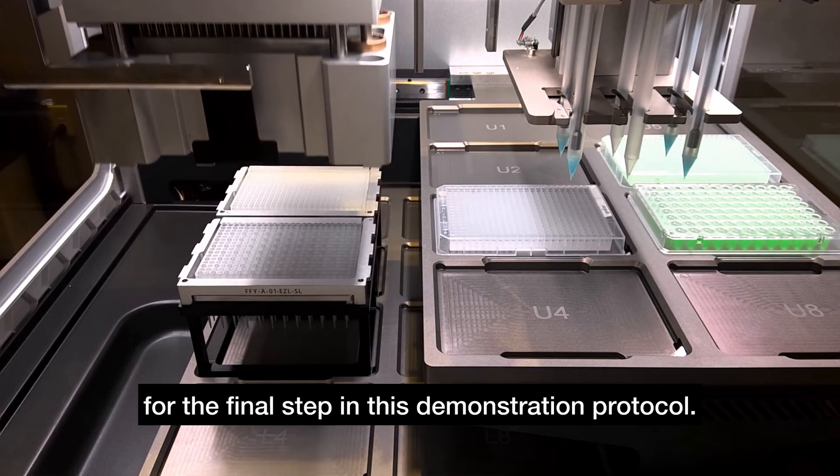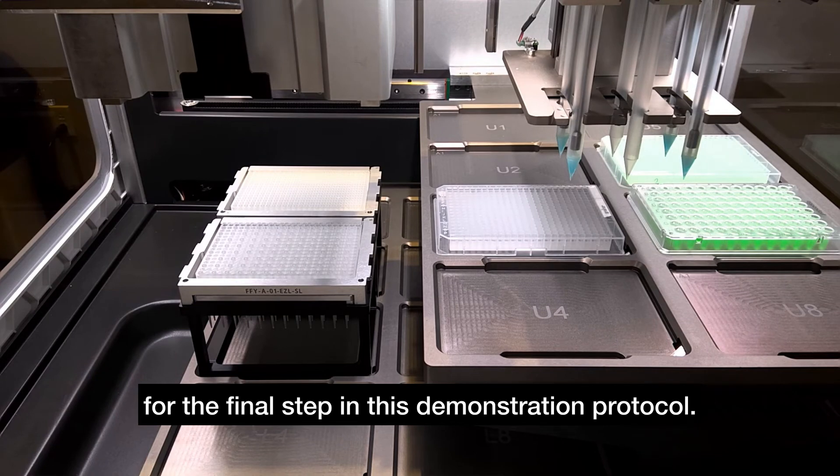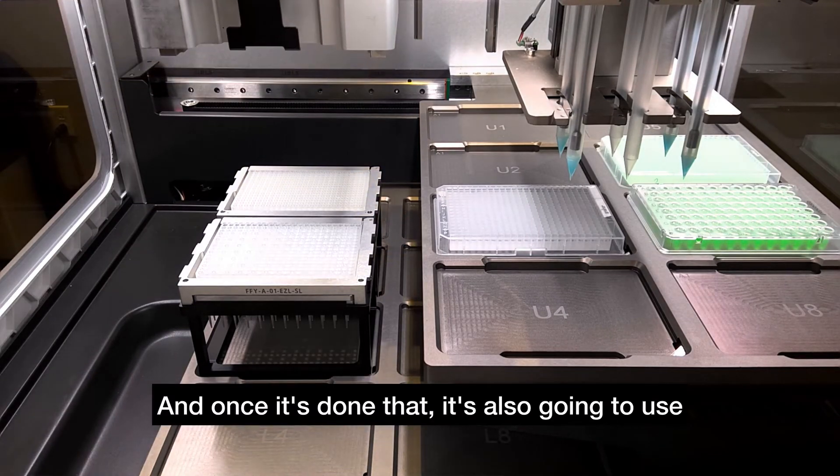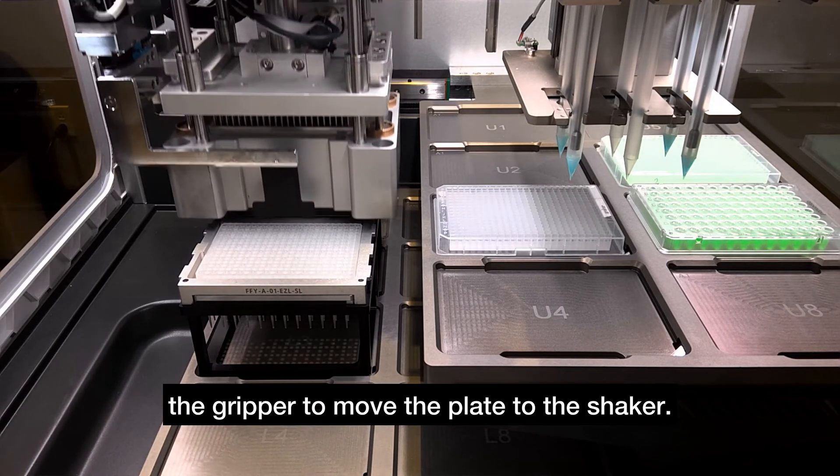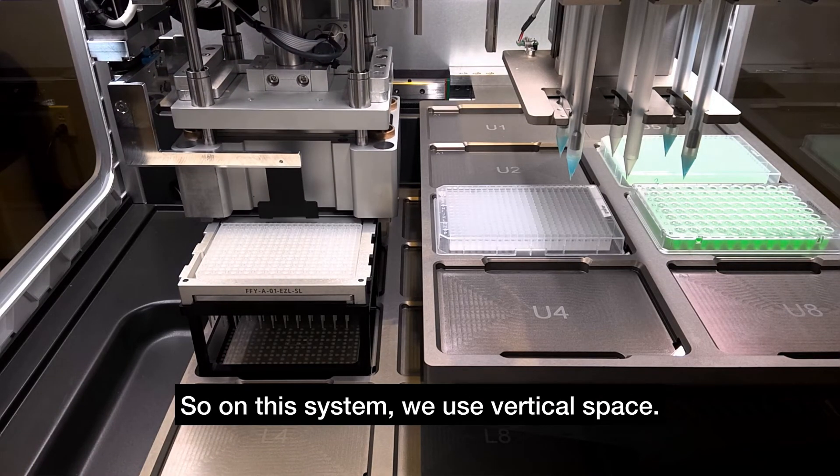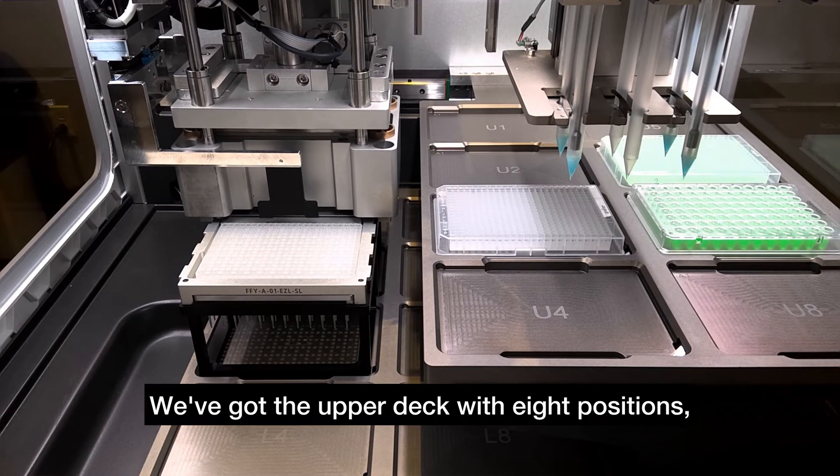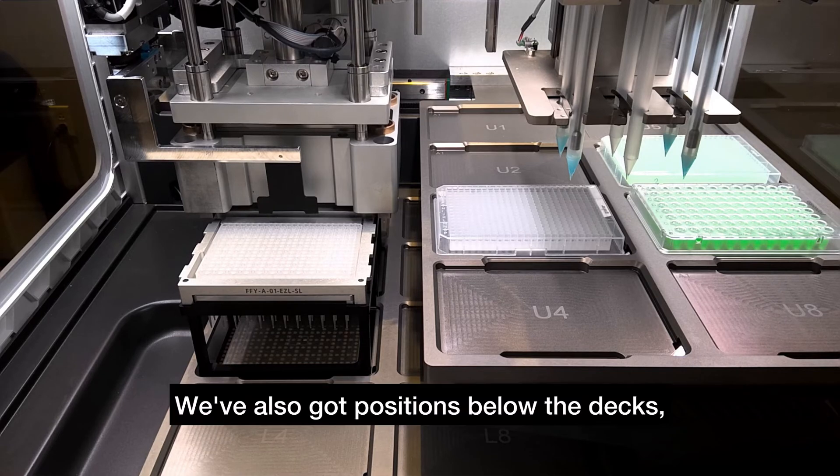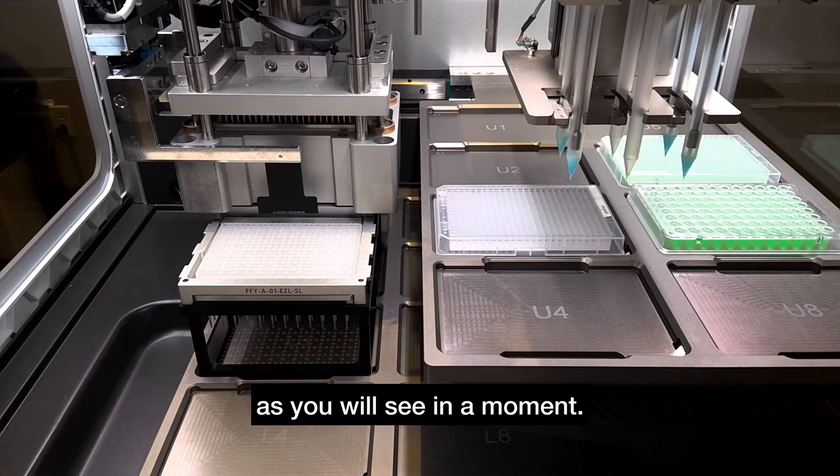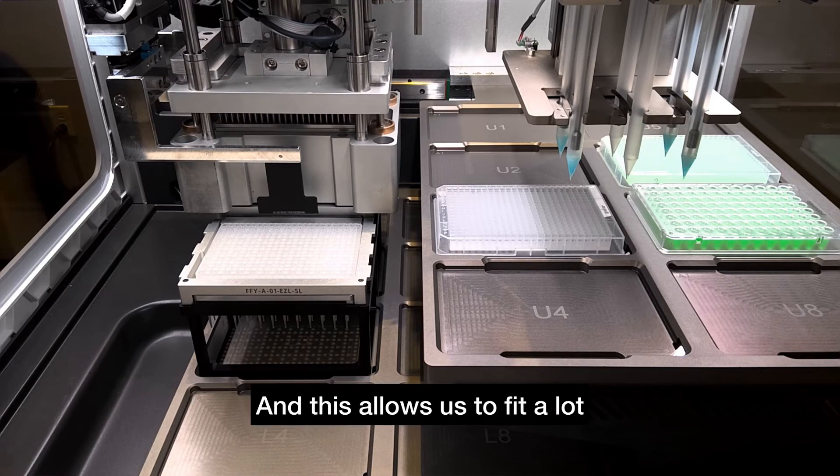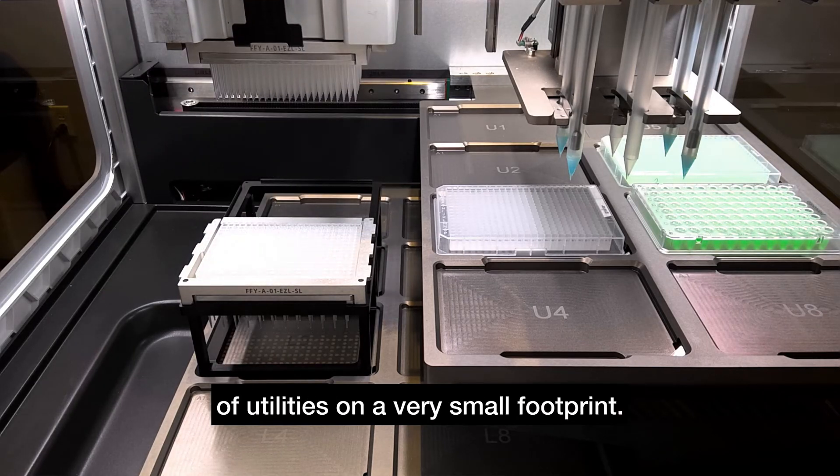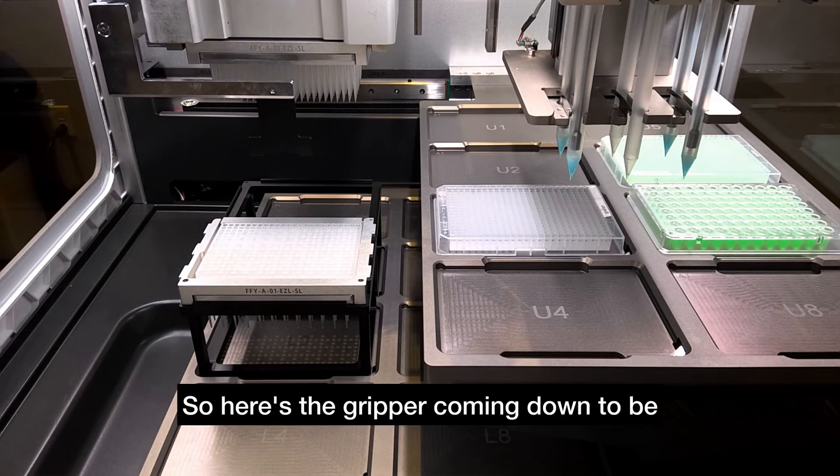Once it's done that, it's going to use the gripper to move the plate to the shaker. On this system we use vertical space—we've got the upper deck with eight positions, the lower deck with eight positions, and positions below the decks as you will see in a moment. This allows us to fit a lot of utilities on a very small footprint. Here's the gripper coming down to be used.